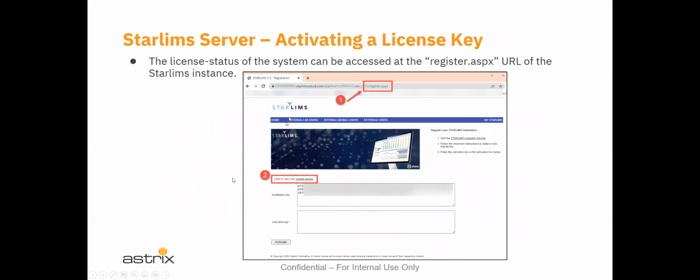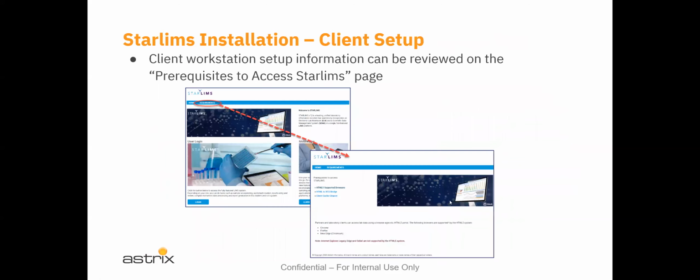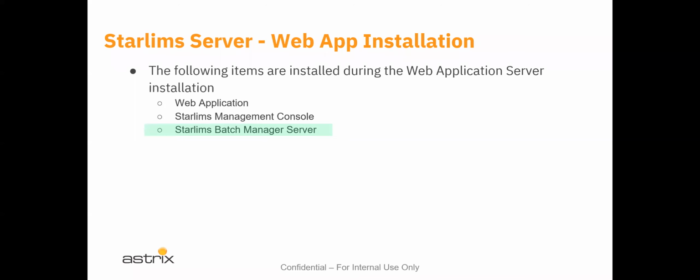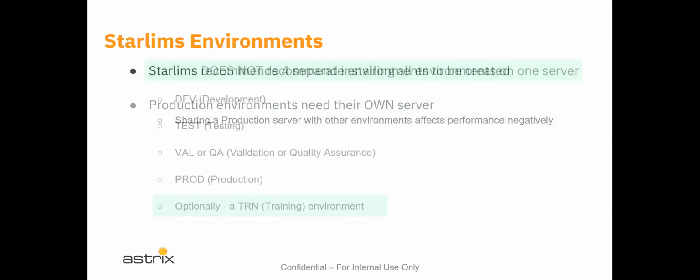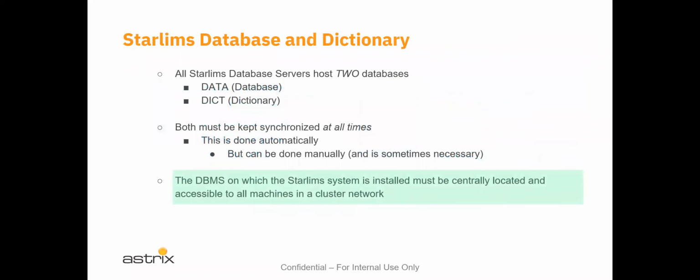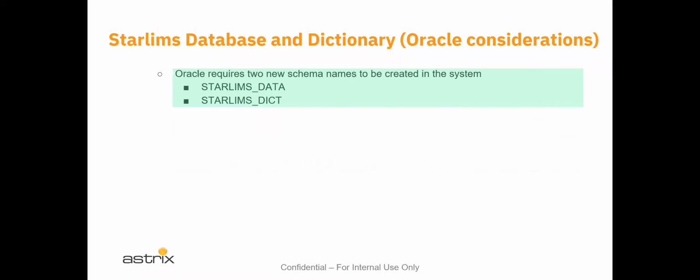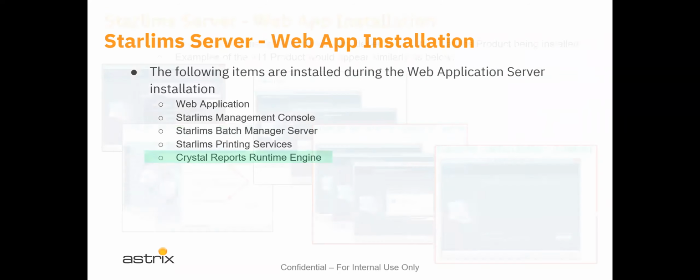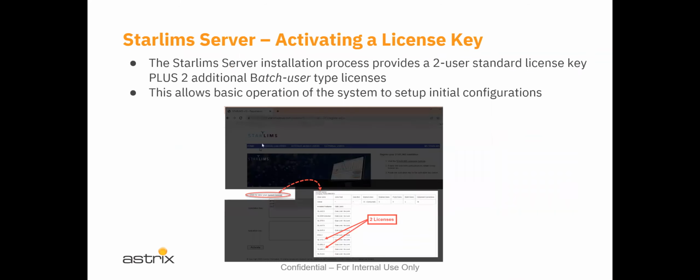And if you come back over to this other form that we were looking at earlier, there it is. That's the one I'm looking for. So here you would see the number increment after having applied the activation key.